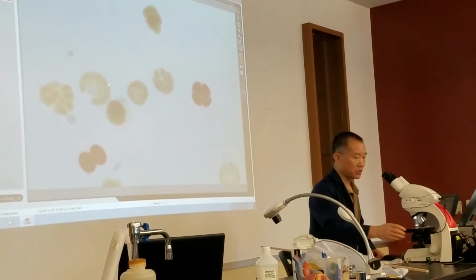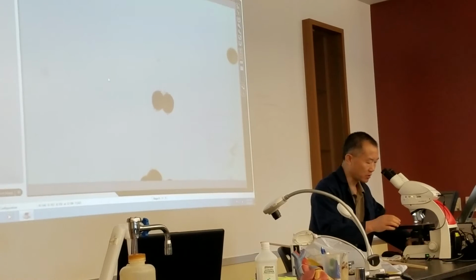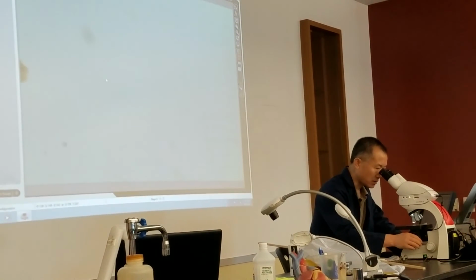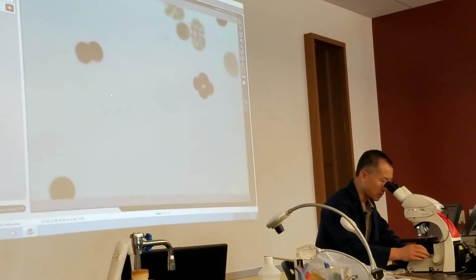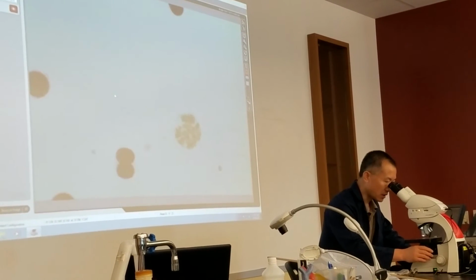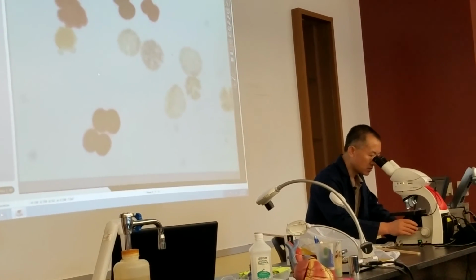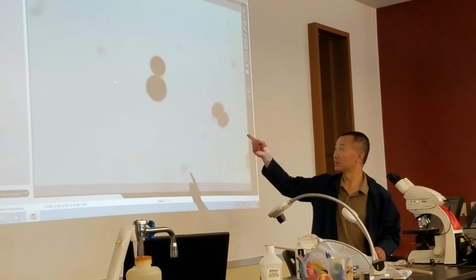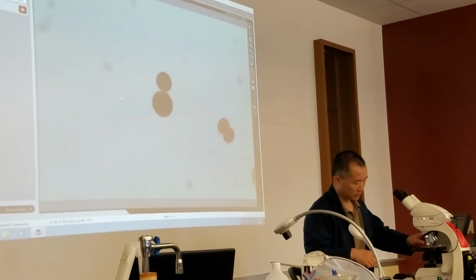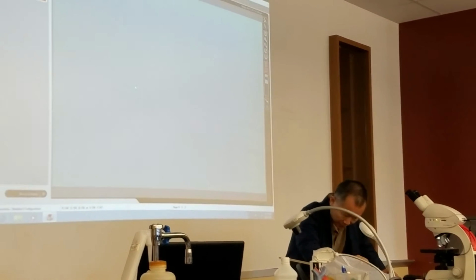And I will also show you a gastrula. I will see if we can find some in these slides. So this slide is for the early stage. No gastrula. 2-cell stage. There are another 2 unfertilized eggs there. Nucleus. So this is one of the slides, early stage.